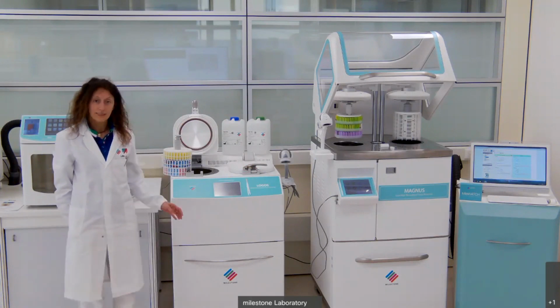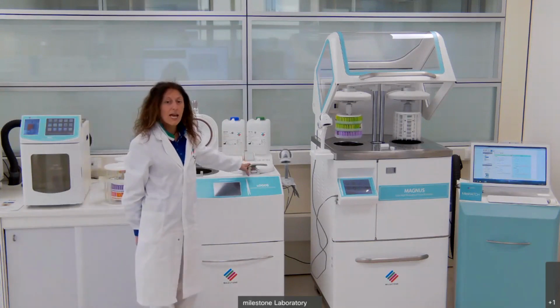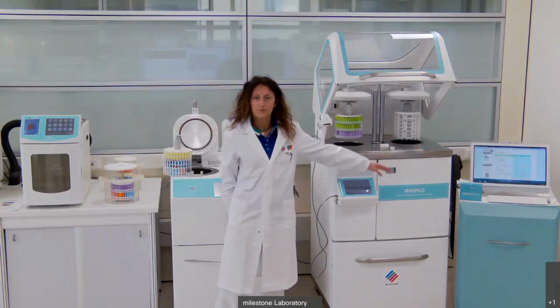And plus, the presence of 2 cavities allows the lean loading of the batch.